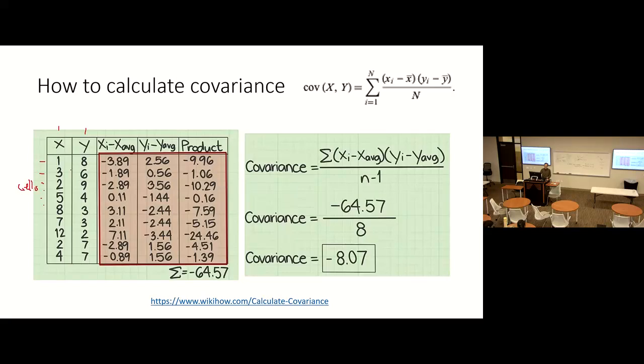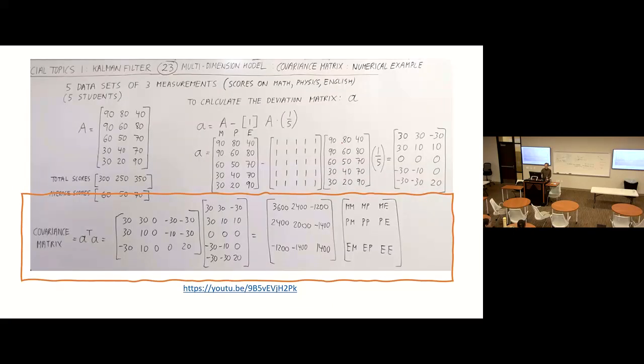Again, the covariance matrix is between genes. Okay, it is not the distance or similarity between cells. So we go to the variable space to define the relationship between variables, making a squared matrix, the covariance between genes. This is how the covariance matrix is computed. Basically, you are taking centralized data.